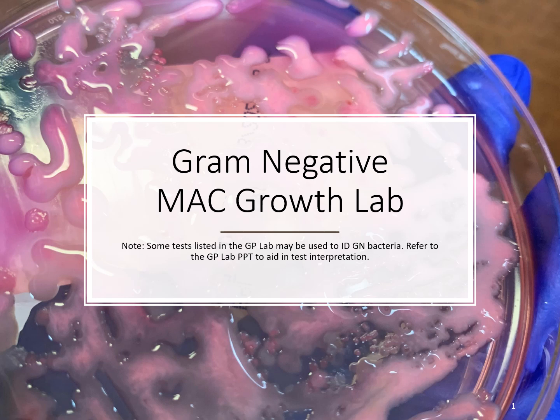This lecture will cover the gram-negative bacilli identification. So these will be the organisms that grow on the MacConkey agar. And of course, some of the tests that would be used to identify these organisms have already been covered with the gram-positive lab lecture.